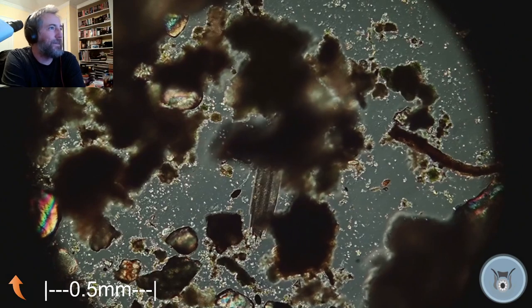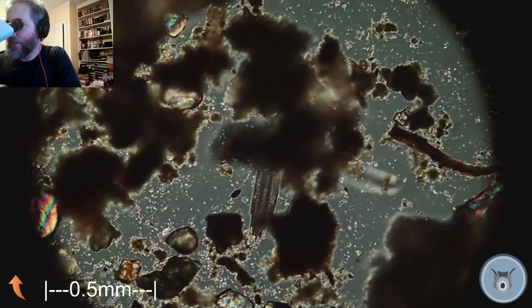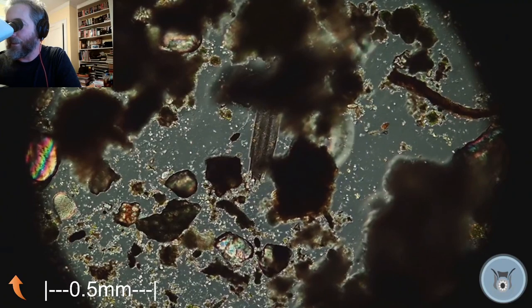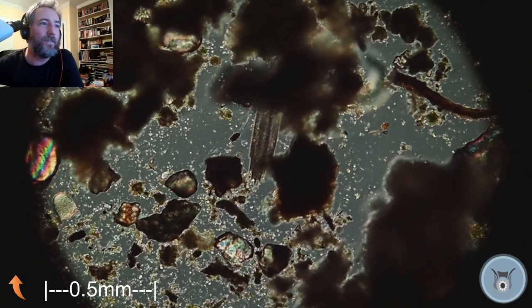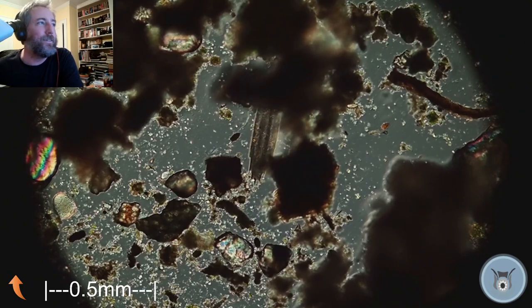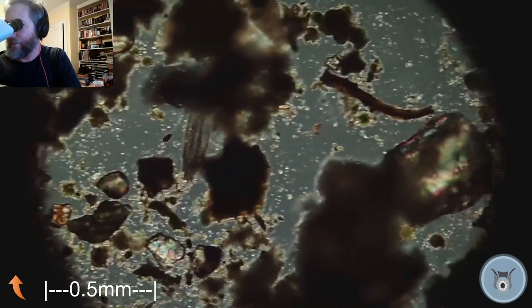We'll put a little water bear in the corner instead. Those are all over their bodies. And so we've looked at those on the SEM before, and that's another reason why I know what it is just from glancing at it: from the SEM, I got used to seeing them. So yeah, it's not pigment that makes the color. It comes from the structure of the scales for butterflies and for moths. It's mostly physical color, which is sort of cool.